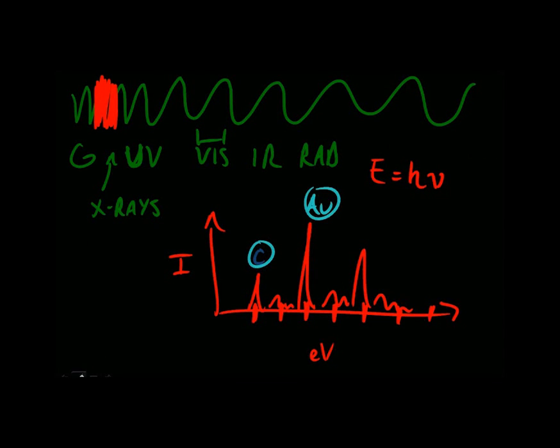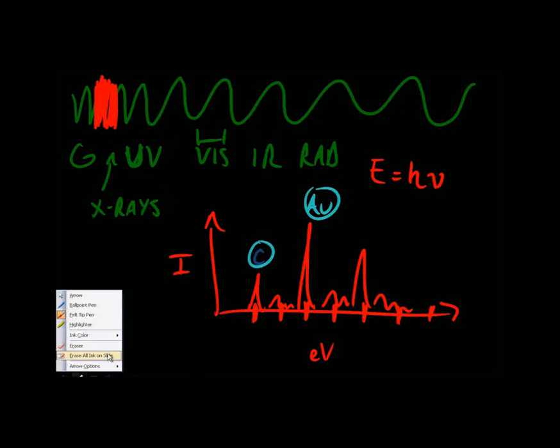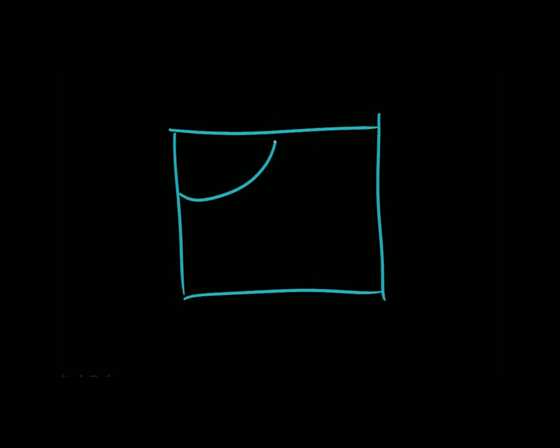Another really cool thing about EDS is called element mapping. An element map looks kind of like this. Let's say this is our sample, and we have different areas on our sample. When you looked under compositional contrast, you got a little bit of contrast. With topography, you didn't get much information. But now you use EDS as a diagnostic tool, and then you click elemental mapping.